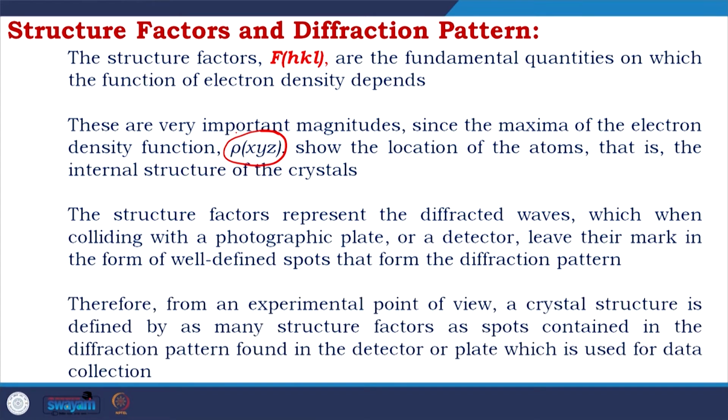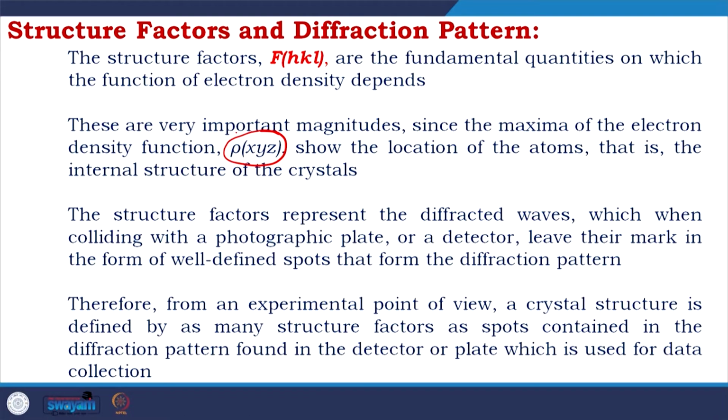And remember, that is why in the last class I was talking about how diffraction patterns are important. Therefore, from an experimental point of view, a crystal structure is defined by as many structure factors as spots contained in the diffraction pattern found in the detector or plate which is used for the data collection.